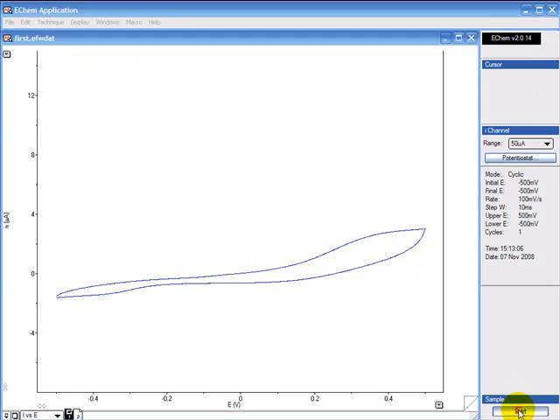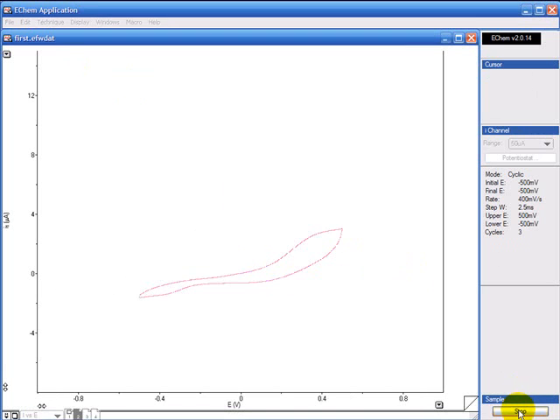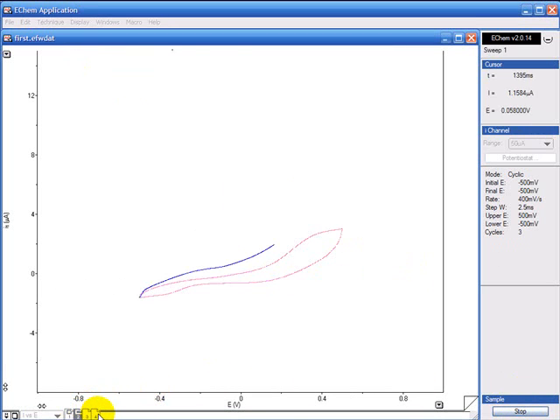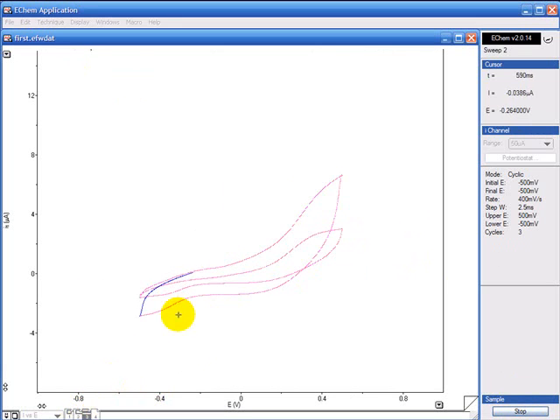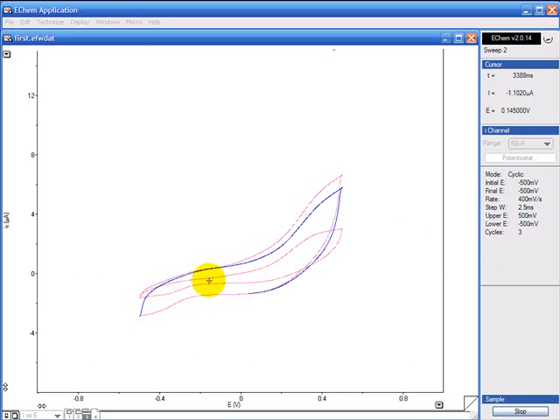Now when I click start, you can see the software has prepared three runs for the cycles I'm going to do. And as it finishes one, it displays the others in pink underneath.